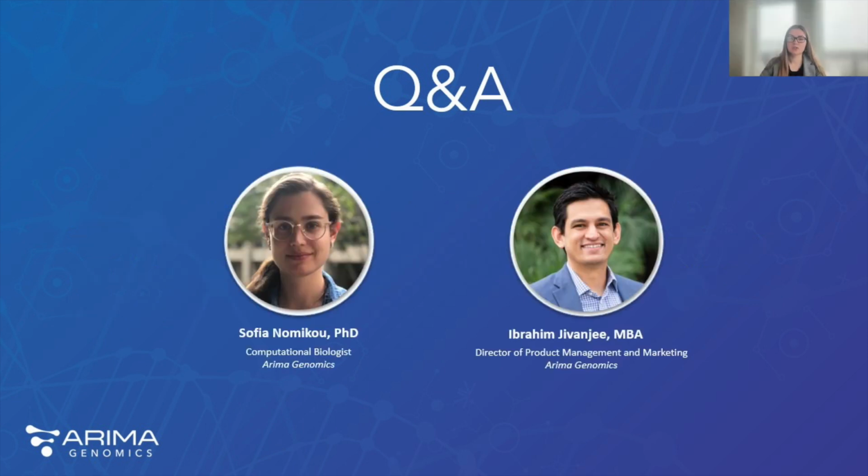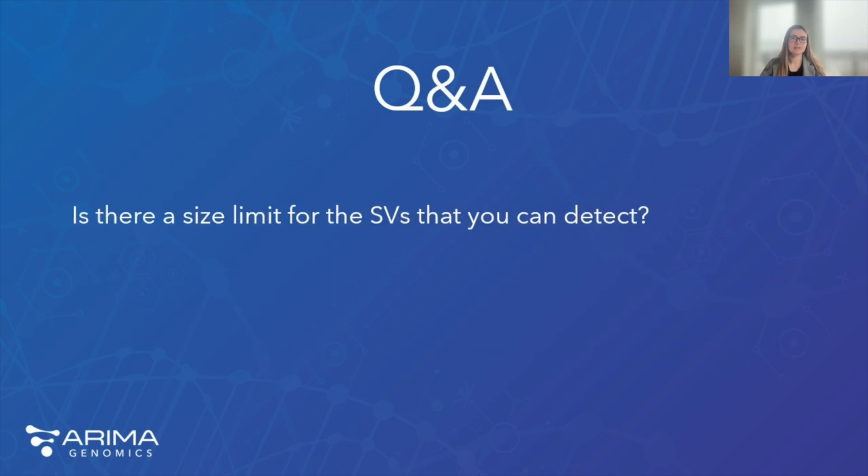Great, thank you. We're just going to go quickly through the questions, see what we can get through in the next 10 minutes. So another popular question from Ian, is there a size limit for the SVs that you can detect? No, the only limit is that this particular pipeline goes up to 1 KB for the resolution of your breakpoint. So the size of the SV can be variable. The question, I guess, is how accurate you can be with your breakpoint. So currently we can do 1 KB with this pipeline, and we're actually working on dropping that even more.